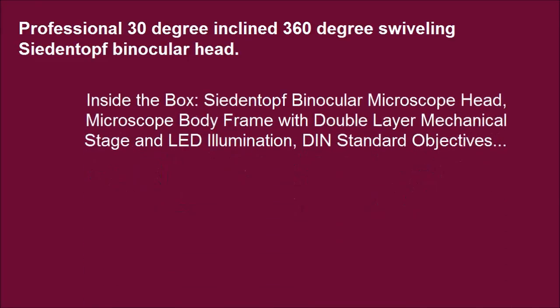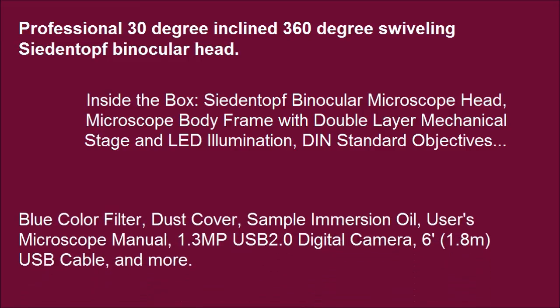Inside the box: a binocular microscope head, microscope body frame with double layer mechanical stage and LED illumination, DIN standard objectives, blue color filter, dust cover, sample immersion oil, user's microscope manual, 1.3 MP USB 2.0 digital camera, 1.8 m USB cable, and more.